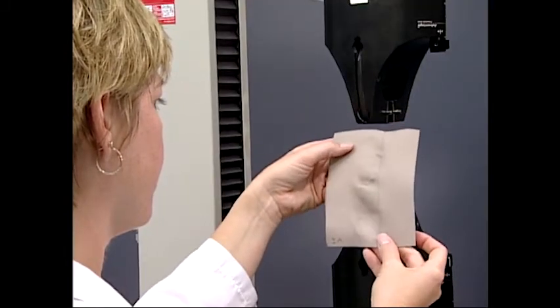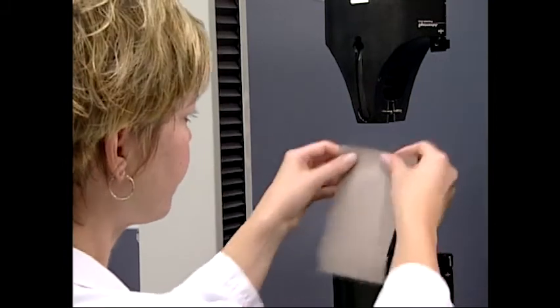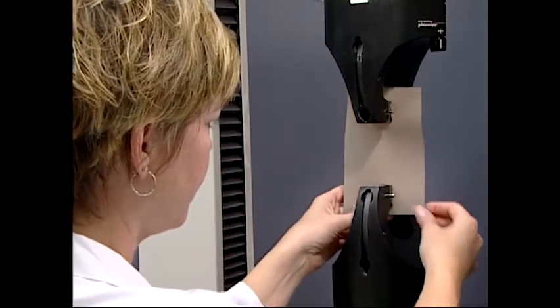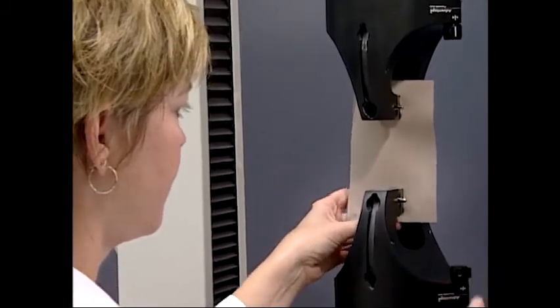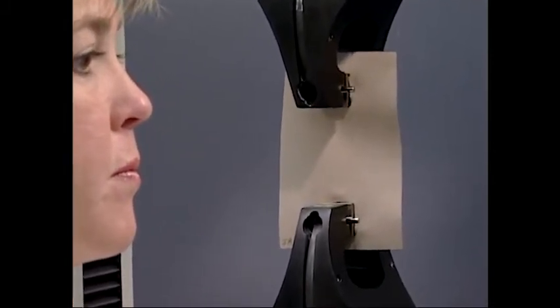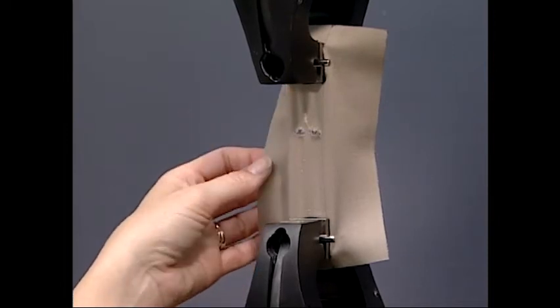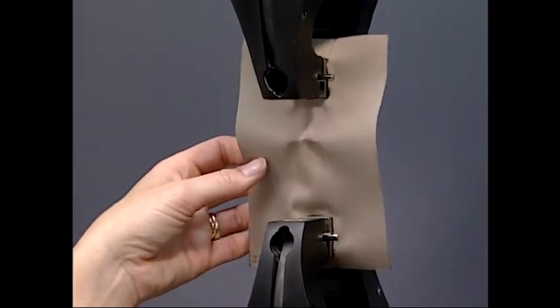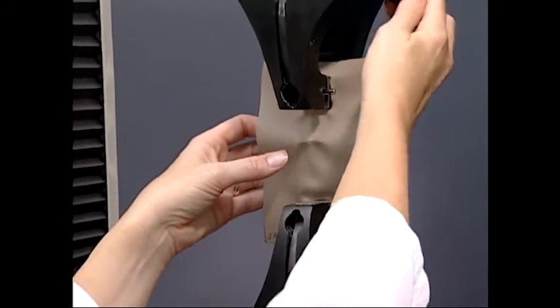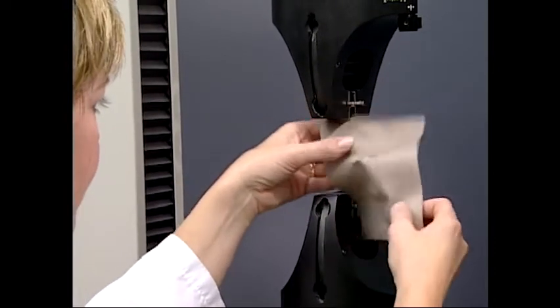Because the specimen is wider in this test than the jaws of the testing apparatus, the adjacent yarns of the fabric outside the jaws will contribute to the stress of the test. This test provides a realistic representation of a fabric under tensile stresses in consumer use and product care. This type of testing refers to the effective strength of the fabric. Further, the grab test data cannot be compared to the strength of the yarns actually gripped between the jaws of the tester or compared to or replace data from yarn strength testing.